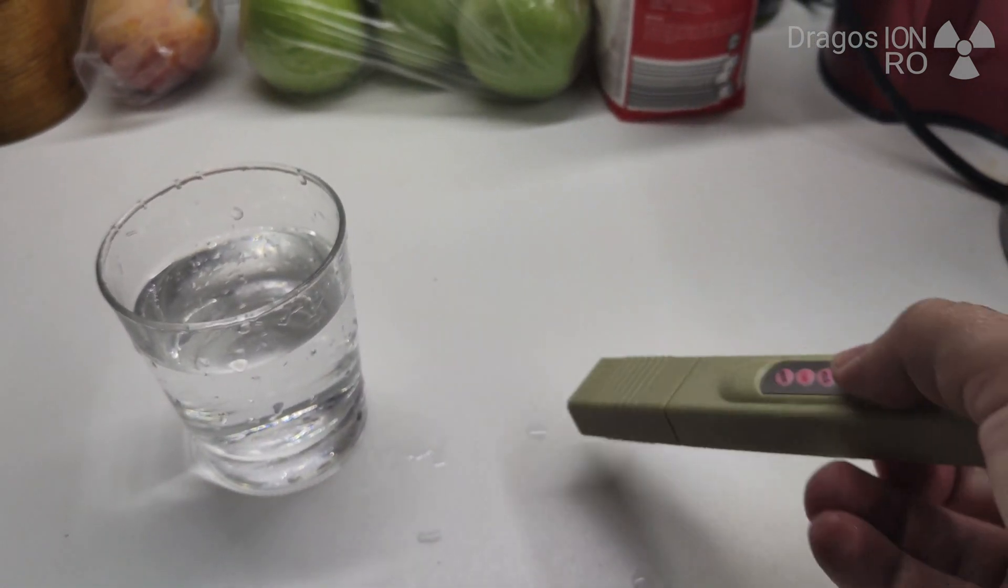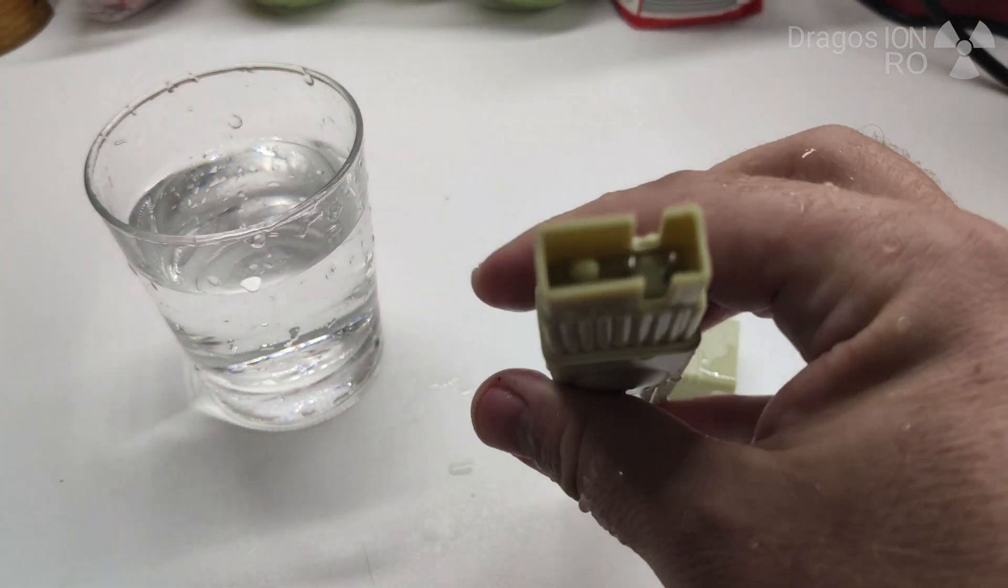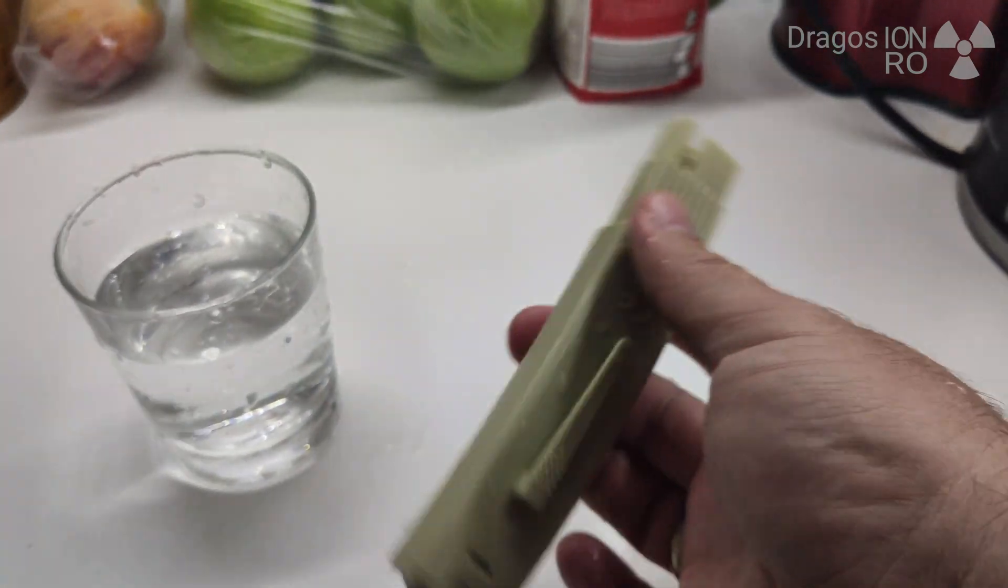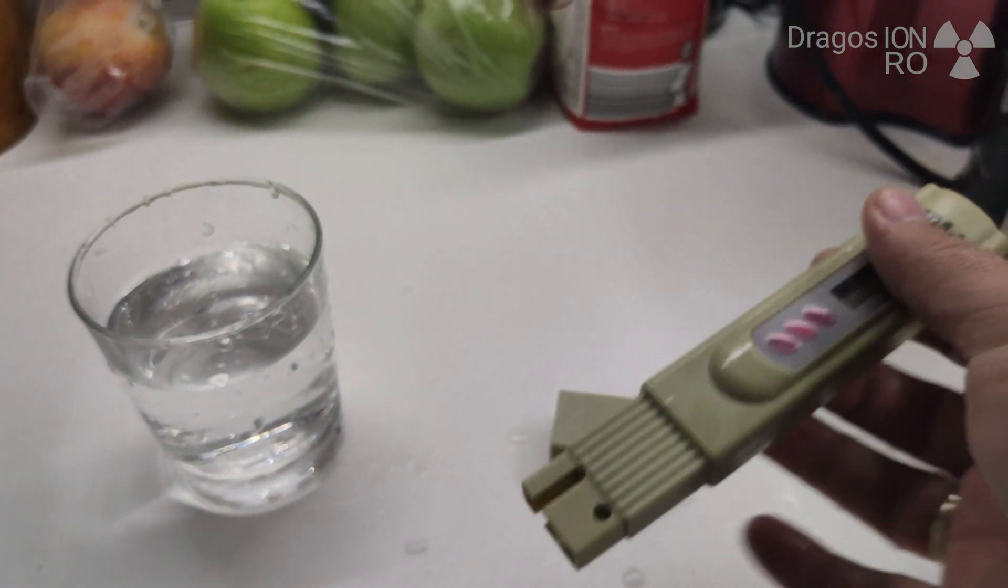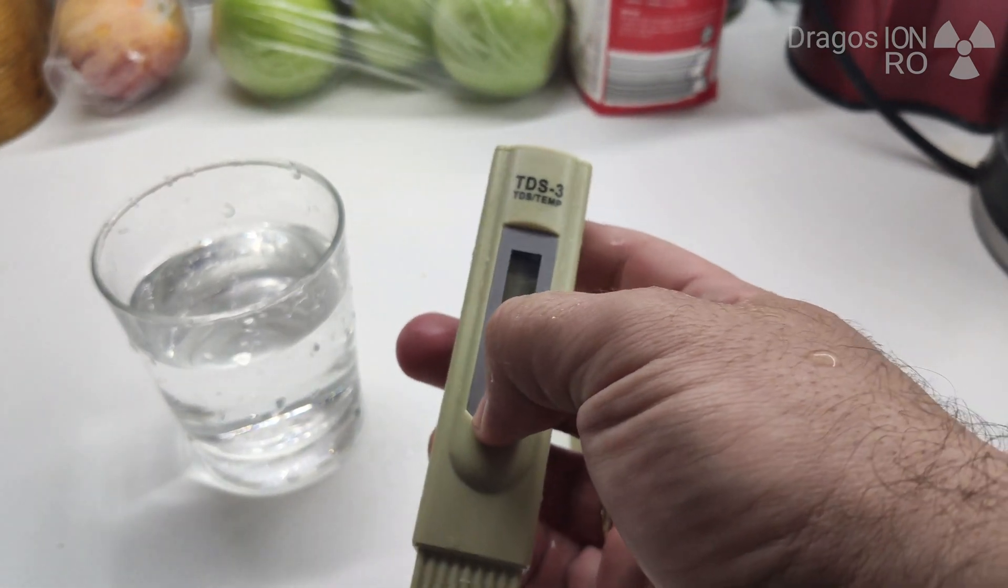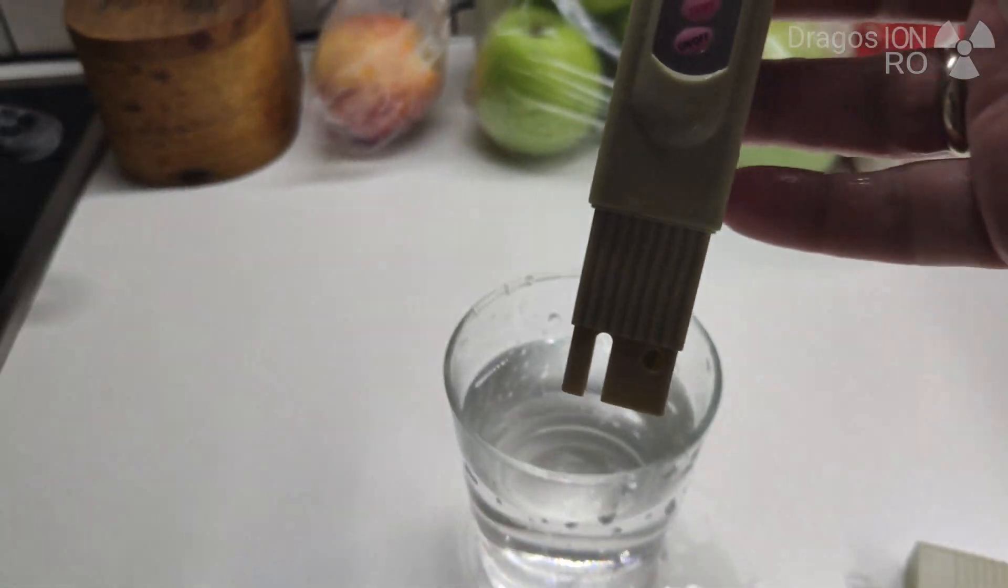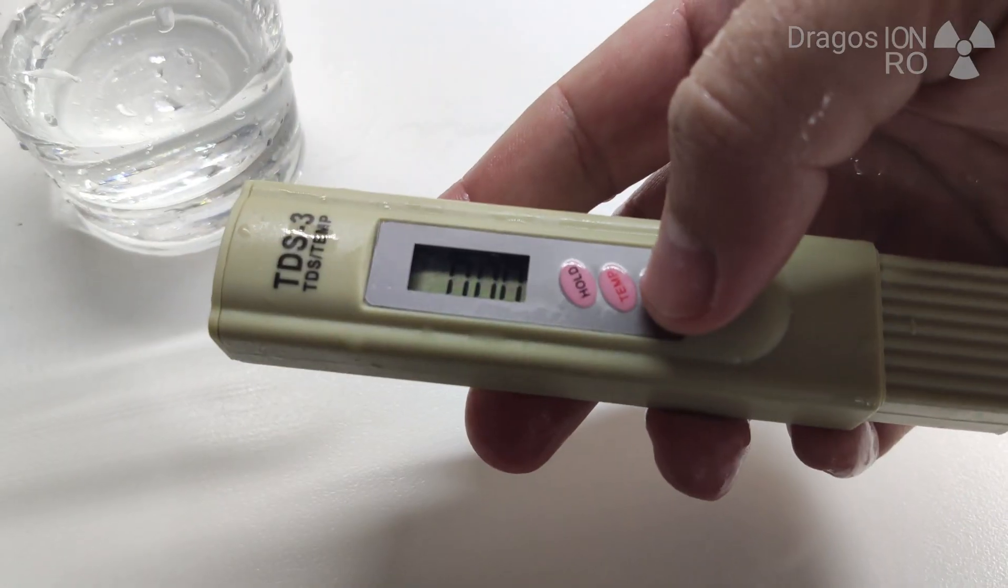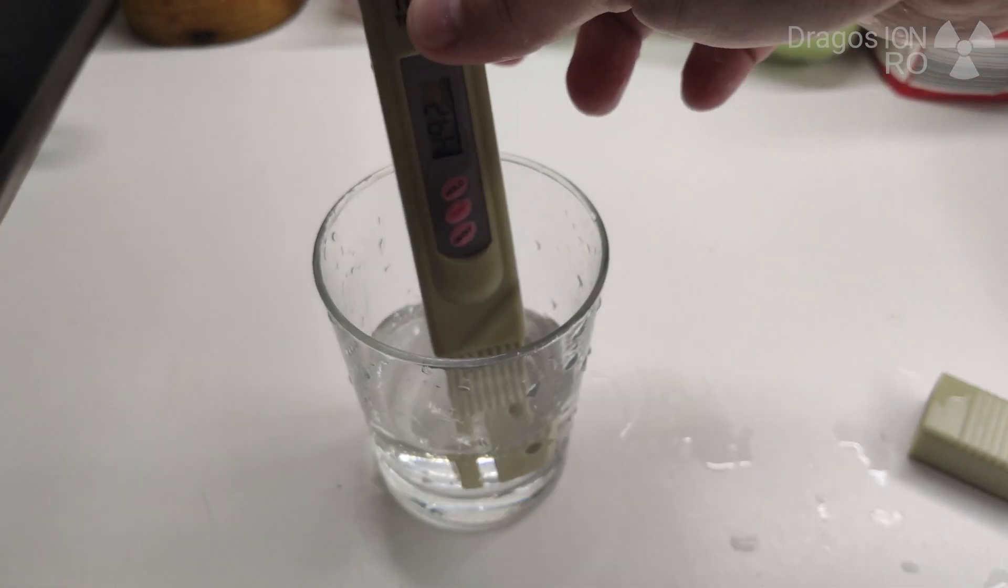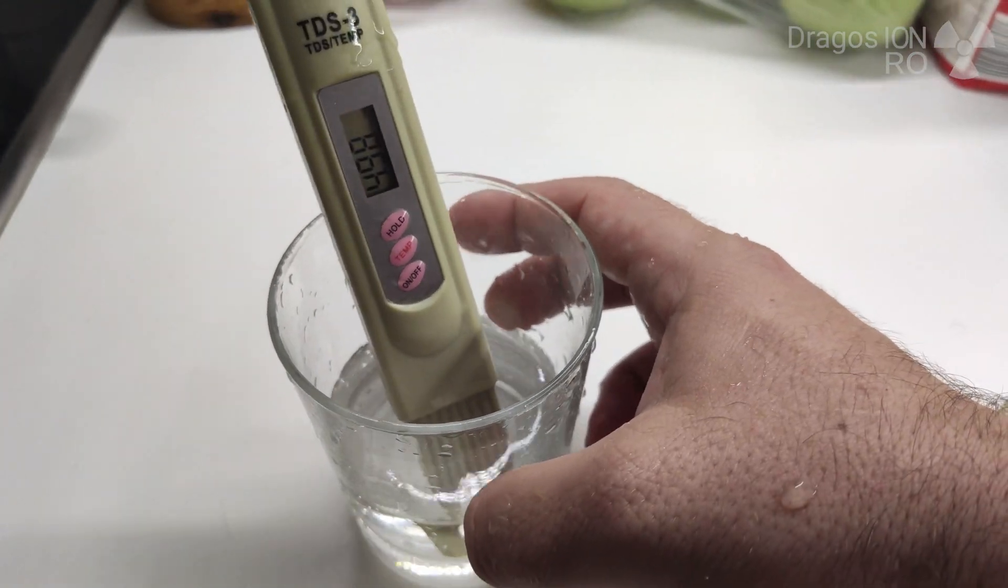So this is TDS 3, version 3. I don't really know much about them, but I know that they measure the conductance of electricity. It has two electrodes and a few buttons, and depending on how it conducts electricity, it will decide how many particles of minerals are dissolved in the water. So this is the TDS meter, measuring PPM values.